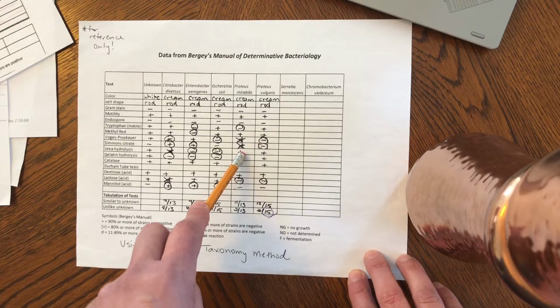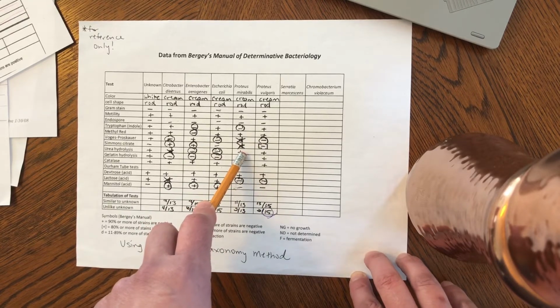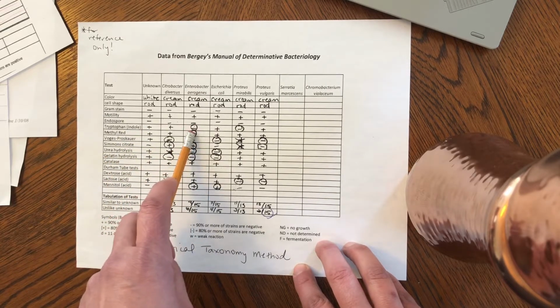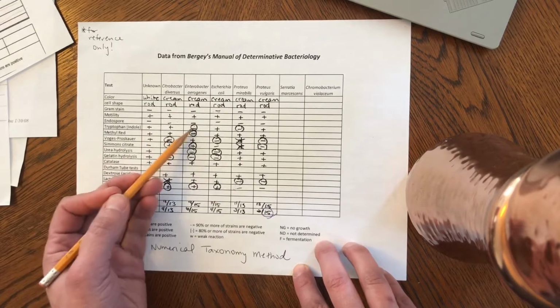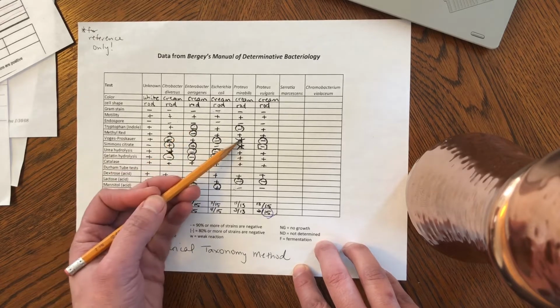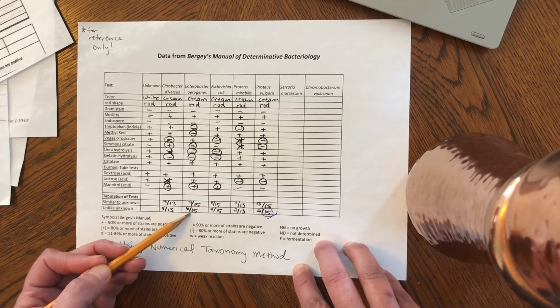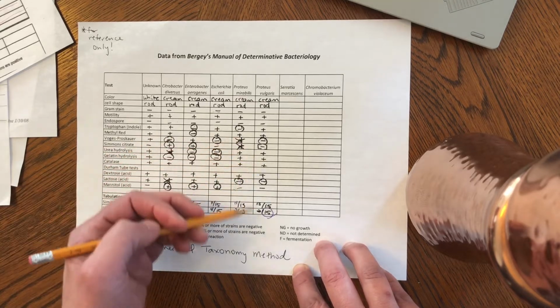Those are those D's that I told you are funky, wonky results that we're not going to count against our bacteria. And then I circled the test results that don't match. So for instance, see here, this test result is circled. I have a positive test result and this one's giving me a negative, so I circle it because it doesn't match. I'm not circling the D's, because I've already crossed them out, meaning I'm not even going to count those. But these other ones are going to count in relation to our unknown. And so you need another way to figure out what you're doing there.